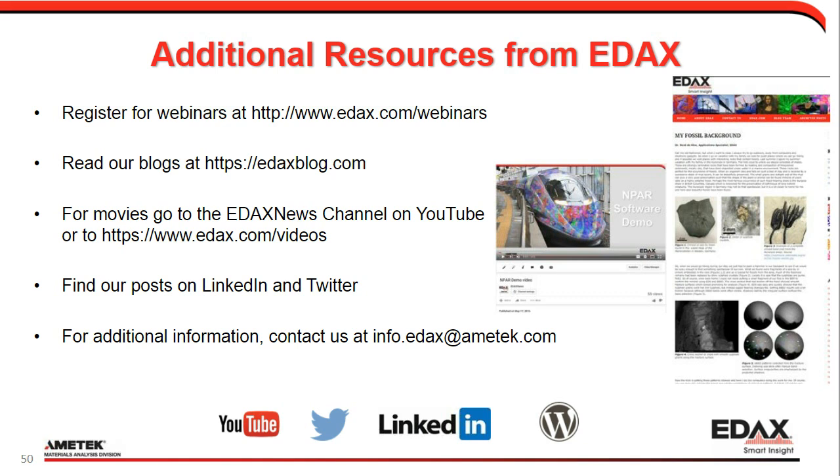You can upgrade from TEAM to Apex. Just be aware that a lot of the TEAM upgrades would require a PC upgrade as well. So please go through our service department for a configuration check if you are interested in this upgrade.